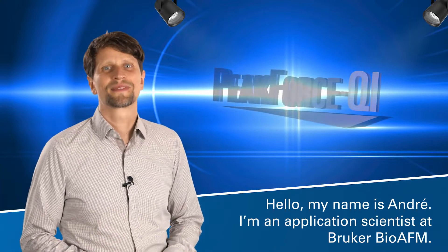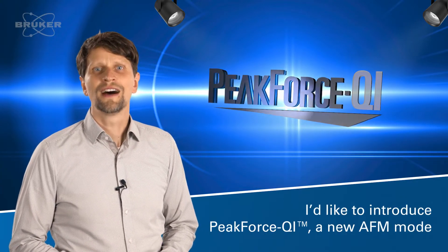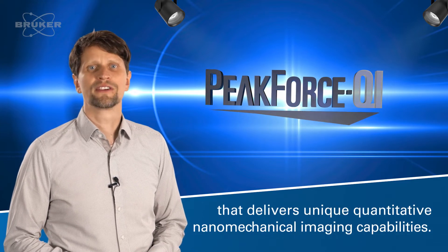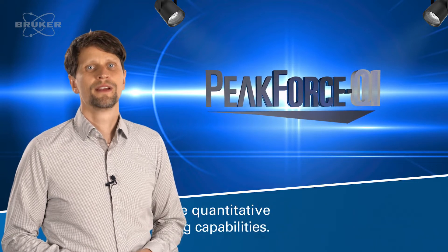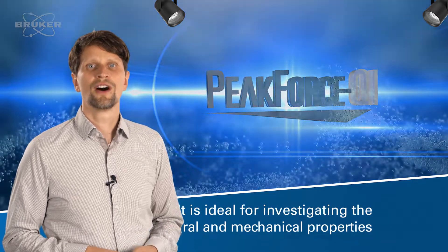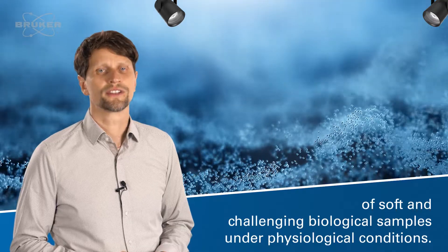Hello, my name is André. I am an application scientist at Bruker BioAFM. Today I'd like to introduce Peak Force QI, a new AFM mode that delivers quantitative nanomechanical imaging capabilities. It is ideal for investigating the structural and nanomechanical properties of soft and challenging biological samples under physiological conditions.